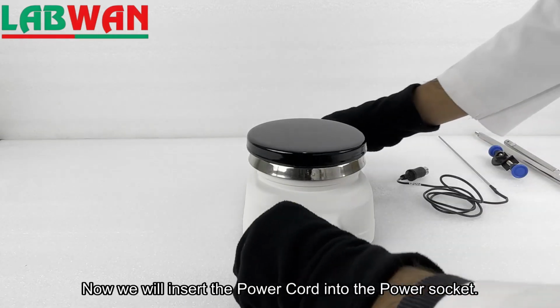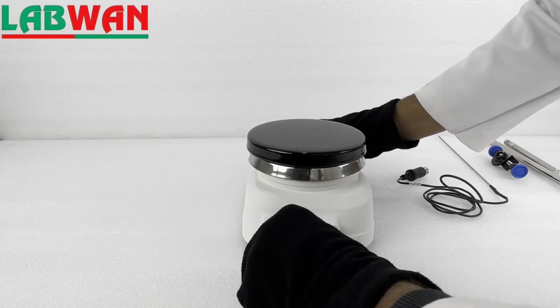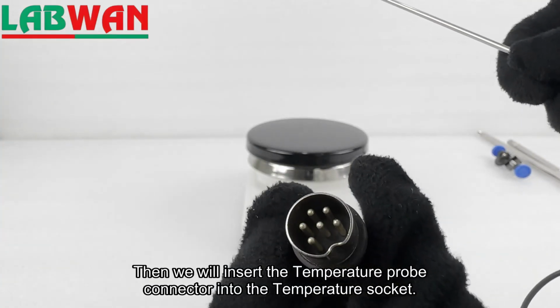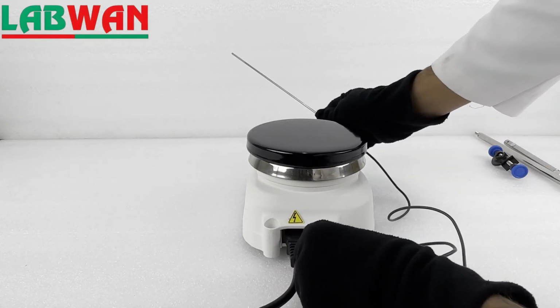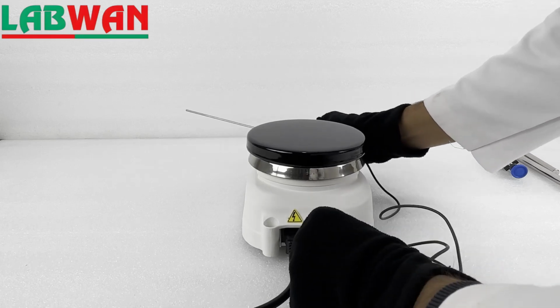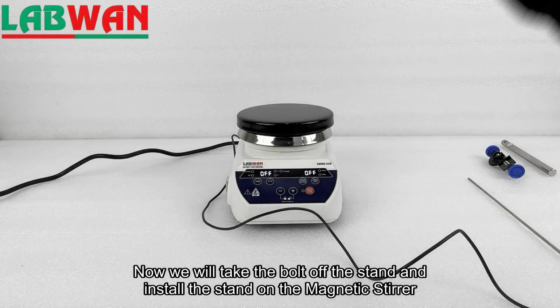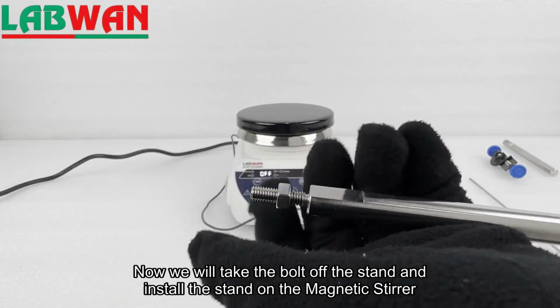Now we will insert the power cord into the power socket. Then we will insert the temperature probe connector into the temperature socket. Now we will take the bolt off the stand and install the stand on the magnetic stirrer.